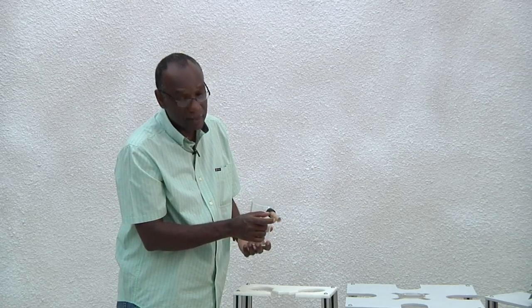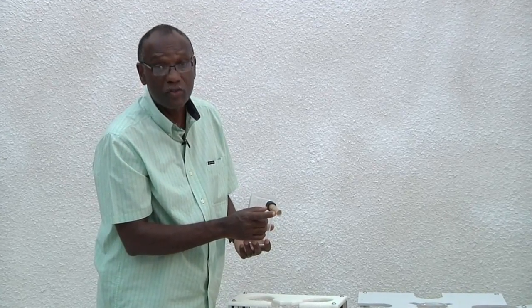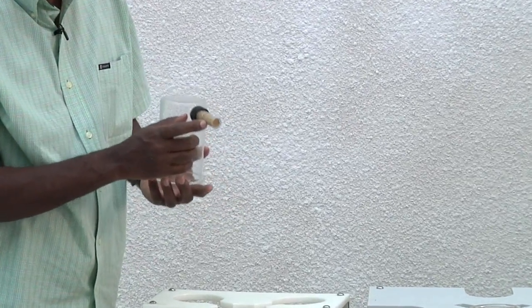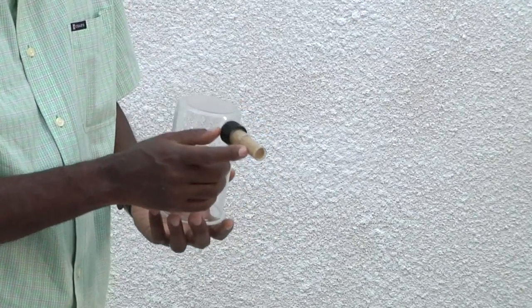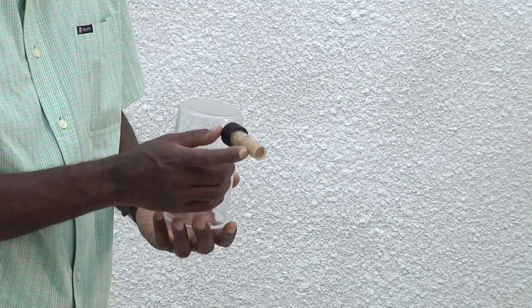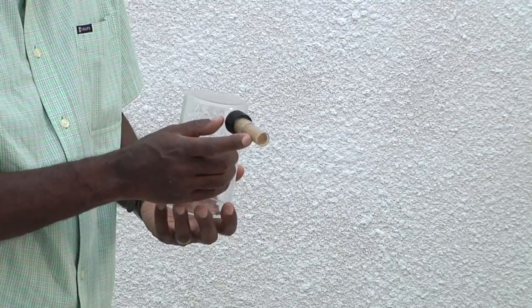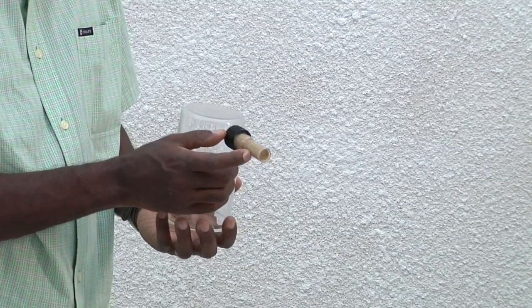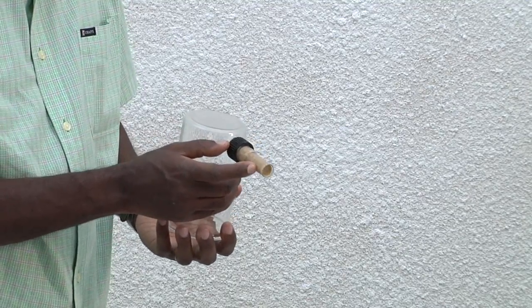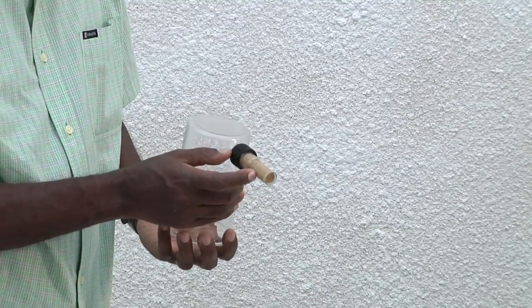Now this is very important to note. The nematode collection chamber — filling this with soil gives you the exact amount that is required for a four-arm or six-arm olfactometer. This is reproducible, it's repeatable, and it is really very important because it holds your nematodes. The amount of moisture that gets in there is exact for all the various arms of the olfactometer.